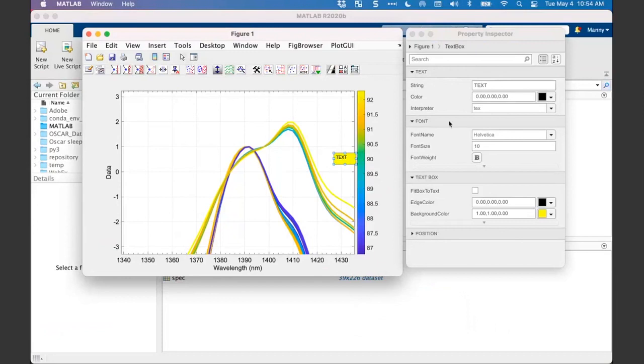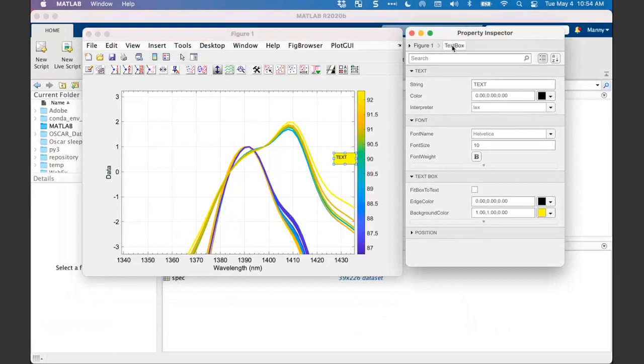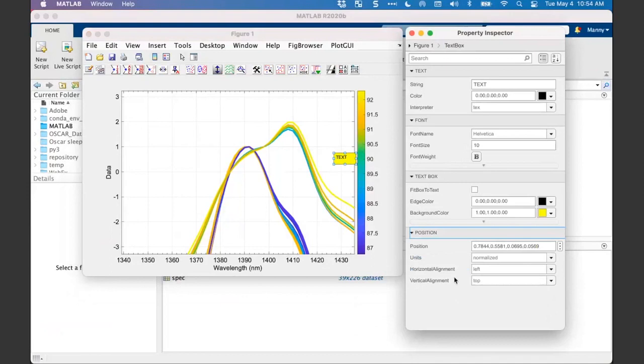Yeah, so here, yes. So these are the deep cuts in MATLAB, because there are a lot of options here. Try position and see if you can find the rotation button. There you just dig down into there. No, this is if I want it in the center. That's the alignment, yeah. Vertical alignment.